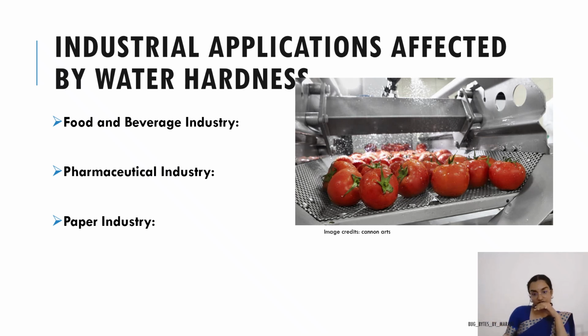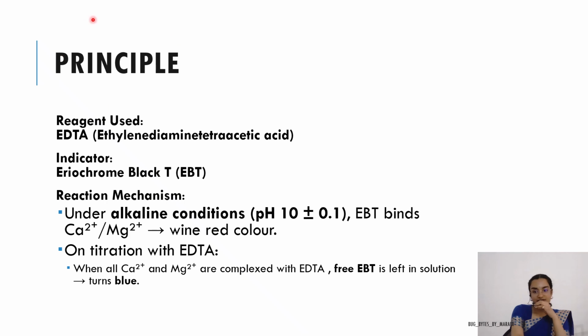It ensures proper water treatment and helps in selecting the right softening method. So all these are the benefits, the reasons why we have to estimate the hardness of water. So let us understand this particular experiment via its principle.